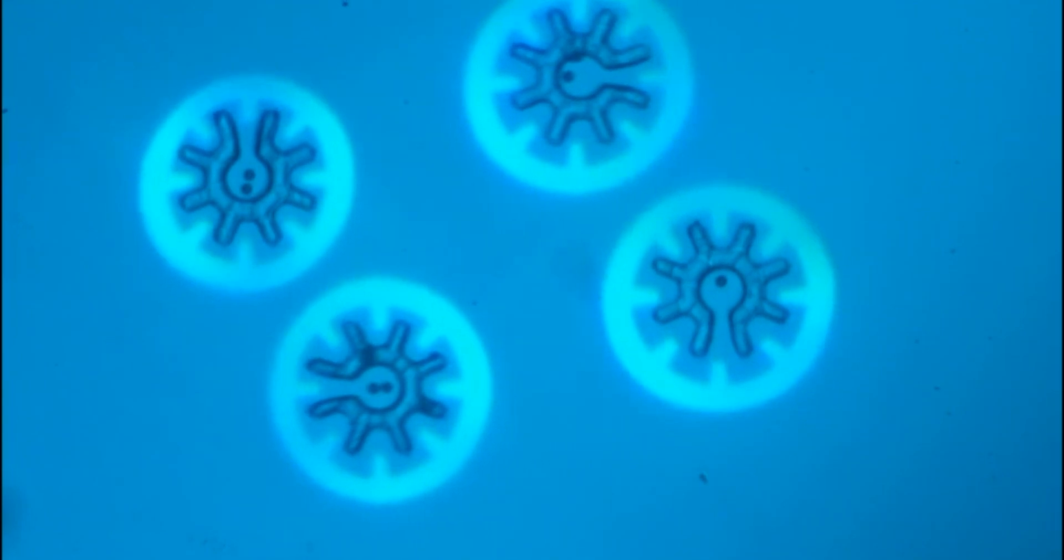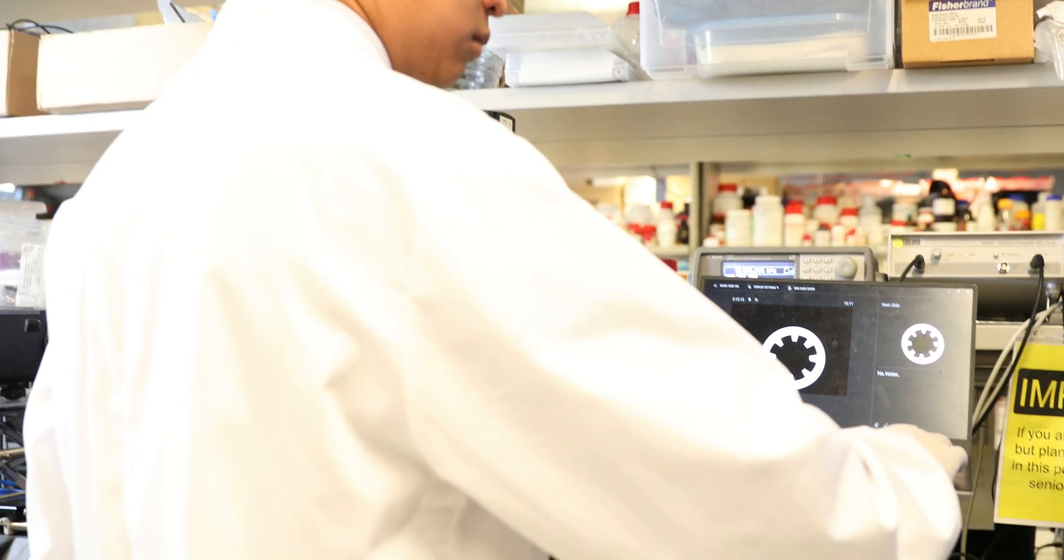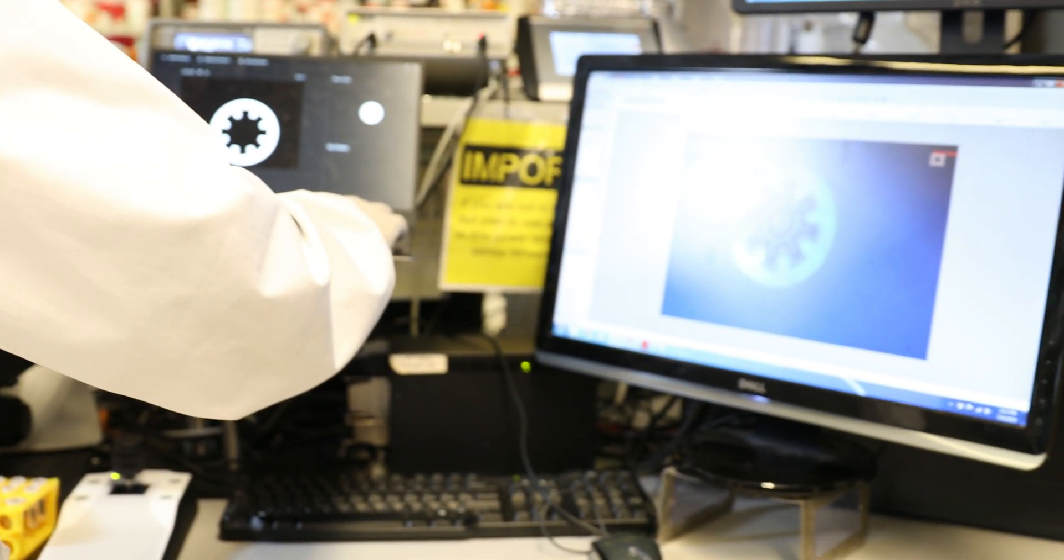We can do parallel manipulation of a lot of micro robots at the same time, and the micro robot is easy to control with a computer interface. So we can maybe in the future combine it with artificial intelligence technology and image recognition algorithms, so there's potential to further improve it.